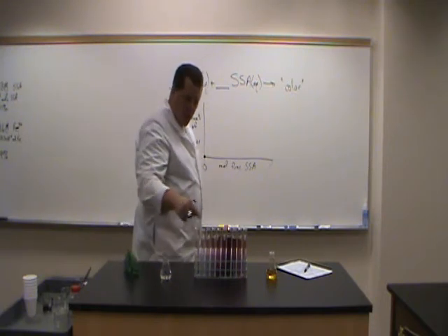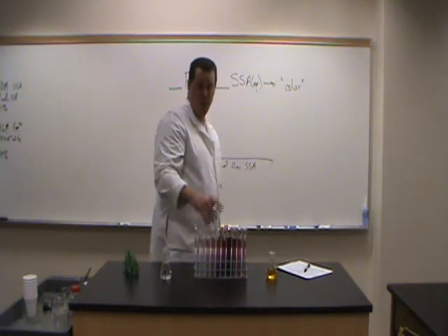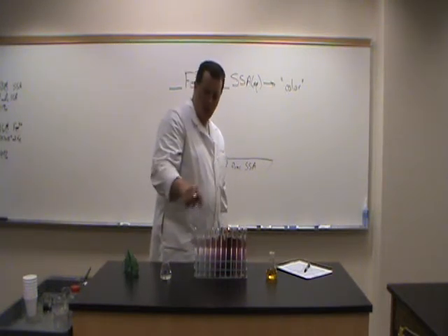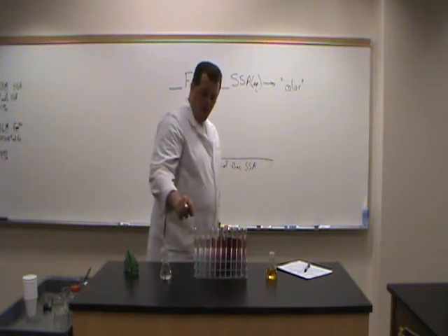But what happens as I increase the amount of SSA? Well, you can see that the color increases. So we're going to be measuring color in a couple weeks, but let's just qualitatively look at the amount of color.